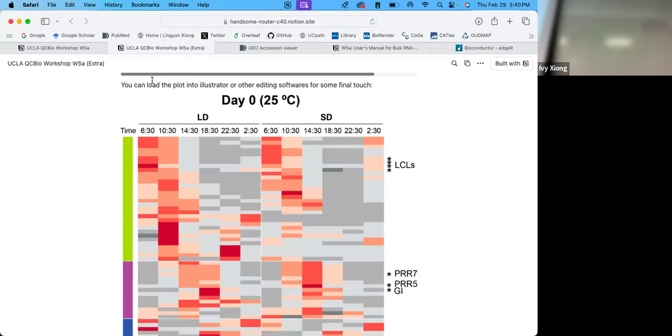Did it work? Yeah, it's working. I'm just so close. Now you know how to start from the beginning, get the packages, load the packages, and then run the individual steps. So it's always good, you can revisit to see what each line is doing. And then if you're using the code in the future, you would actually have a better handle.